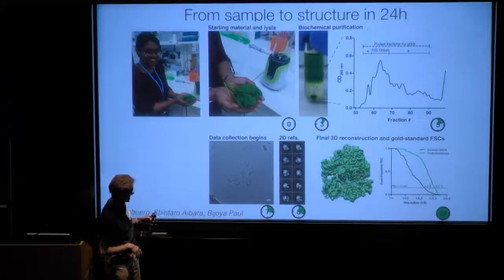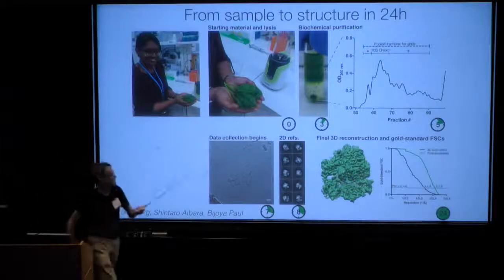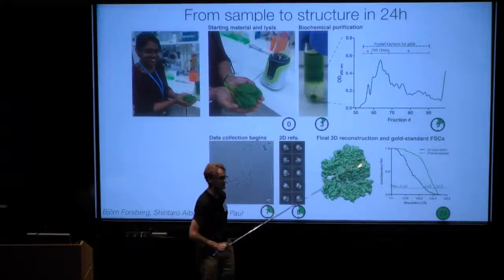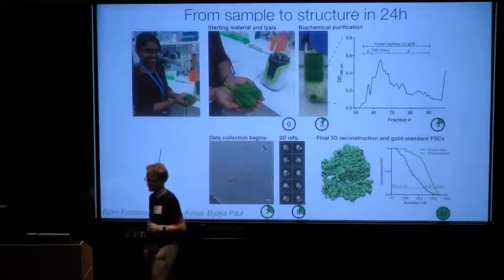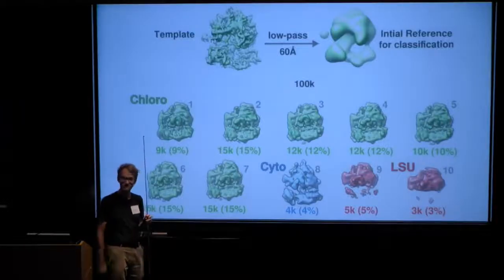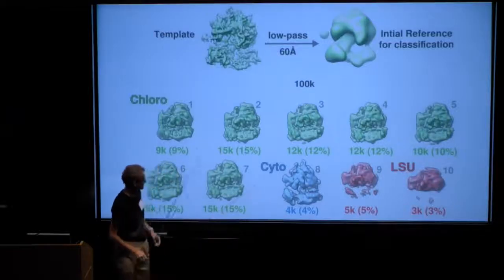As you can see, just to make things harder here, not only do we include the chlororibosome, we deliberately include a bunch of junk fractions too, just to see if the computer can sort that out for us. And the cool thing is that it does. So you don't even need to do proper biochemistry anymore. Really bad students just throw computer time at it, and the computer will sort out the stuff that you don't want to have there.